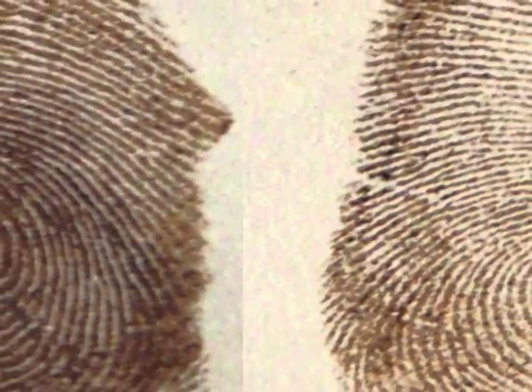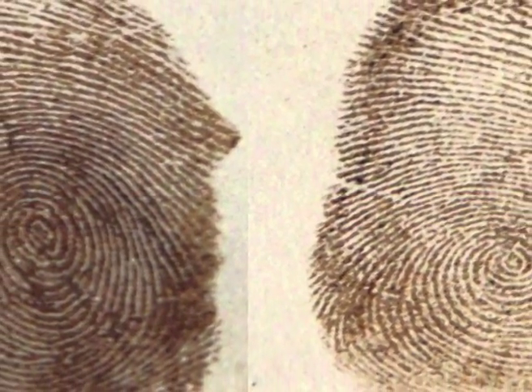Next is the assessment of iodine method. The iodine method for detecting latent fingerprints has the following advantages. The procedure is very simple to use and requires only a meager degree of skill and experience.